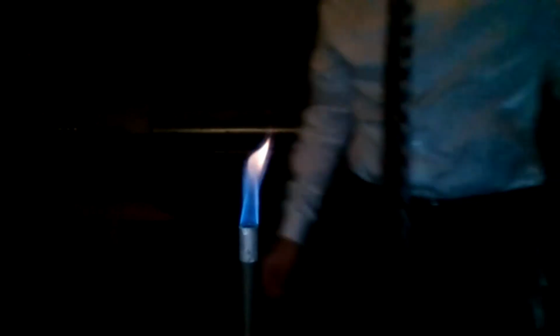Okay, so for how the unknown works, what I want you to do is I'm going to pick one at random. I'm going to put it on a Q-tip and I'm going to burn it for you. And I want you to write down what color it is in the box. And then if you look underneath, there's the question. So question one is, what metal do you think unknown one represents and why? I want you to take a guess as to what that metal represents. So whenever you have your guess, I want you to go ahead and send me a private chat of what you think it is. So, we'll start with this one. This is a tough one, but it will be one of the ones that we looked at before. Okay, are you ready? So this is unknown one.